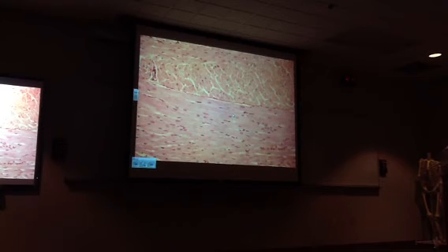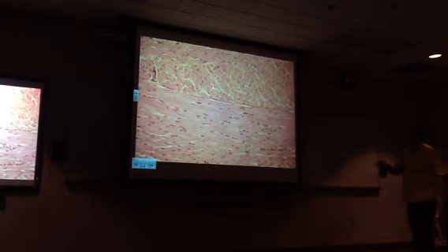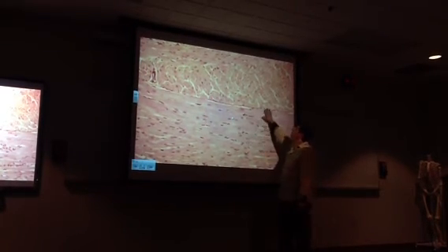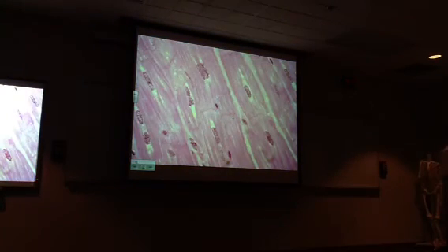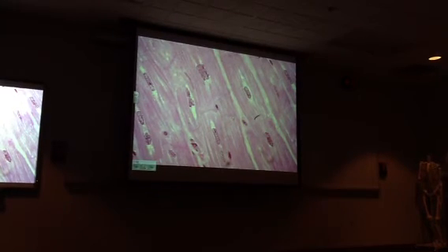It's cardiac muscle. It's obviously in the heart somewhere. Where you see that much cardiac muscle. The slide isn't in the great focus, but this would be in longitudinal section and in cross section. Higher power view of cardiac muscle. The intercalated discs are nicely seen.